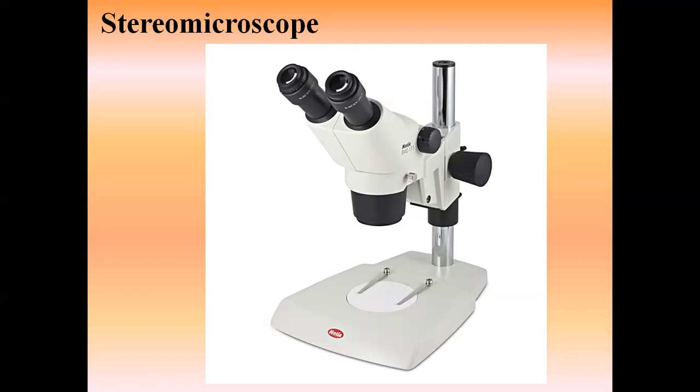Some insects, some grains, some concrete material, some fiber needs a 3D view.